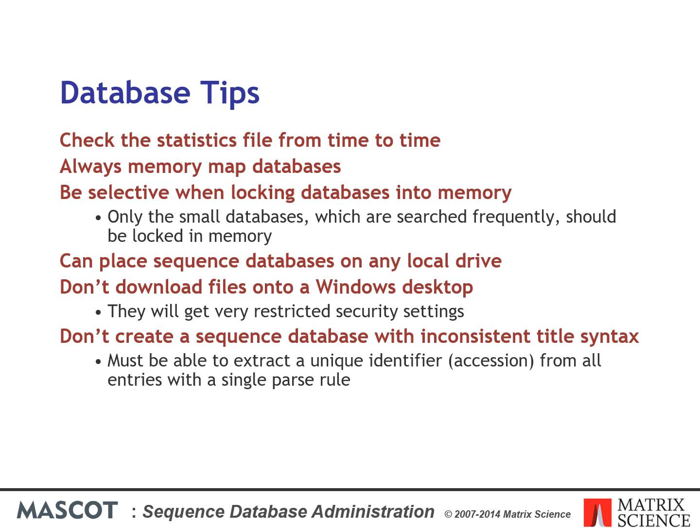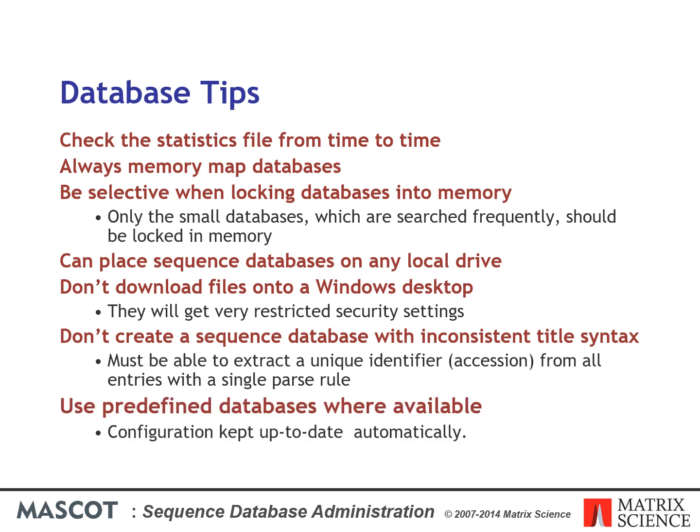If you create your own Fasta file, use a consistent title syntax. It must be possible to extract a unique identifier from all entries with a single parse rule. Use predefined databases where available because this means the configuration is kept up to date automatically.